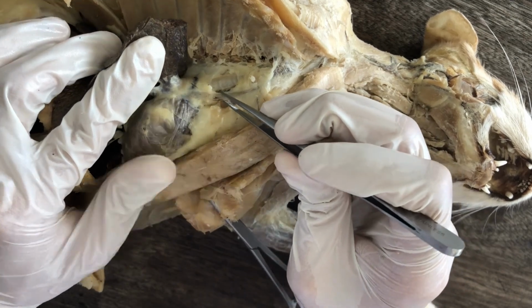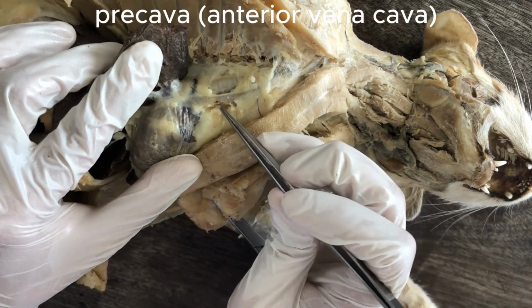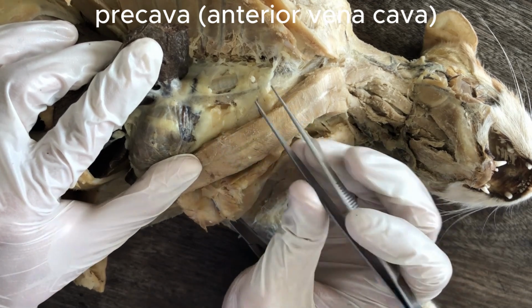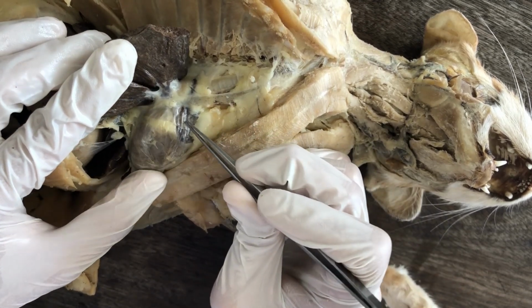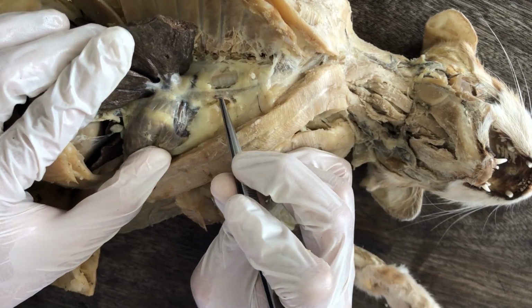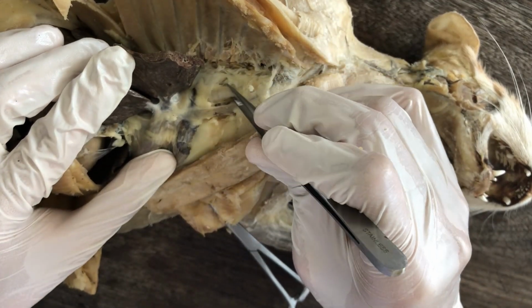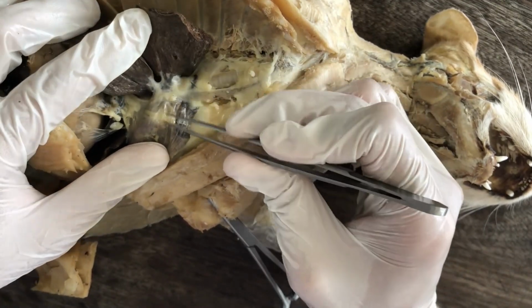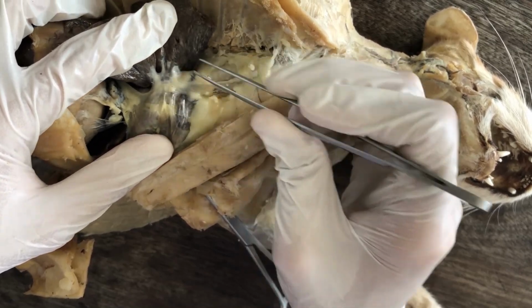That's the precaval vein, also called the anterior vena cava or superior vena cava, and you can see that it enters the right atrium of the heart. So that's the precaval vein. That's the trachea, about to split into the bronchi, entering the lungs via the root.